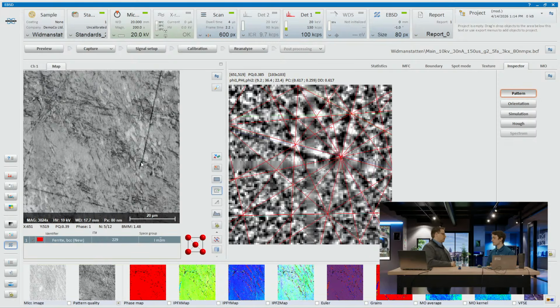Now, in terms of generating this, so you had generated this beforehand. You'd done this indexing. How manual is this versus how automated it is? So you take the data, and then what do you do? Do you just hit a button and it does it, or what do you have to do? Pretty automatic. I mean, I had to give it a couple bits of information.